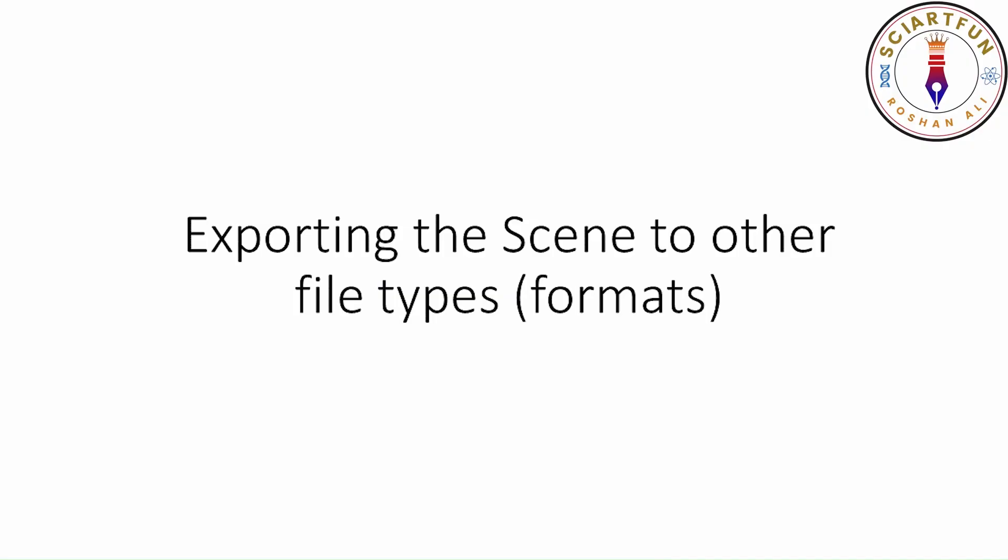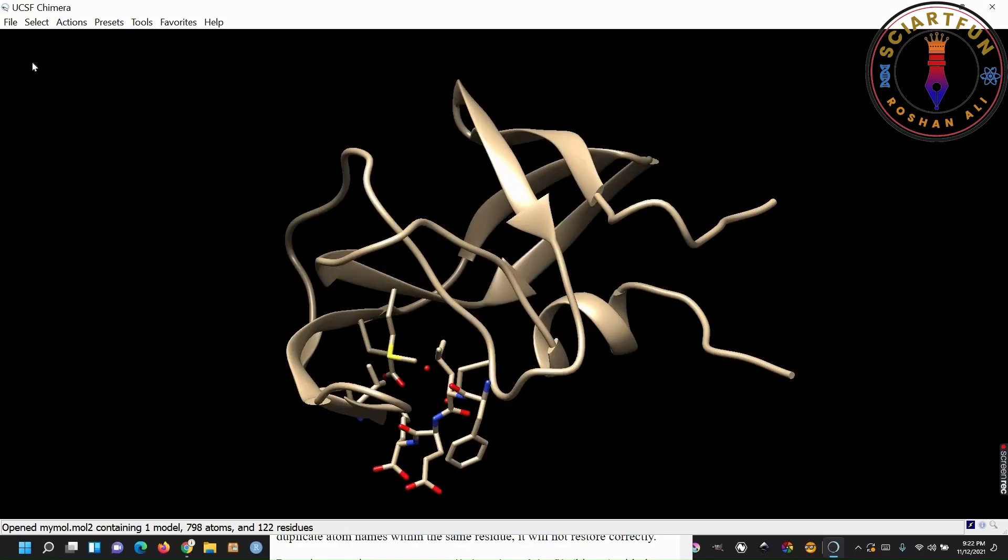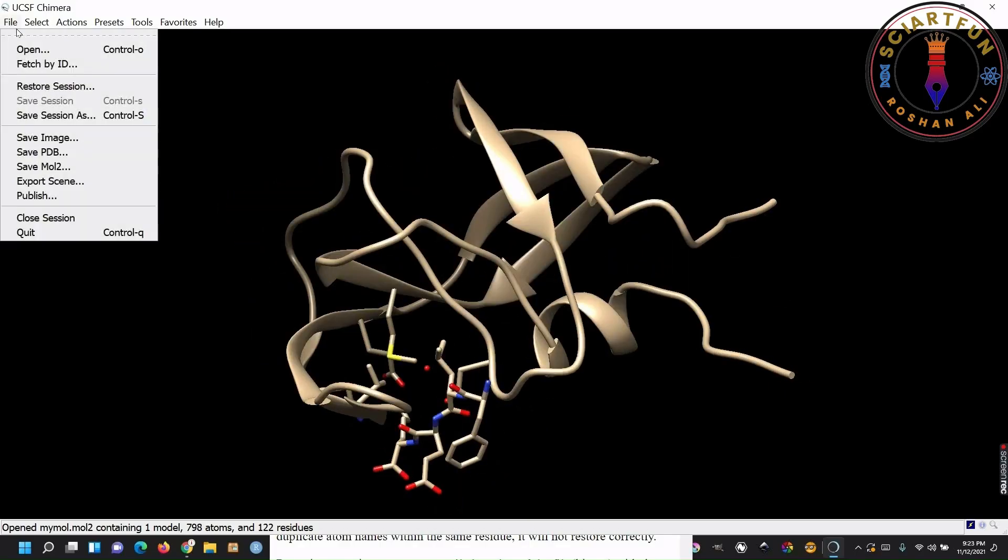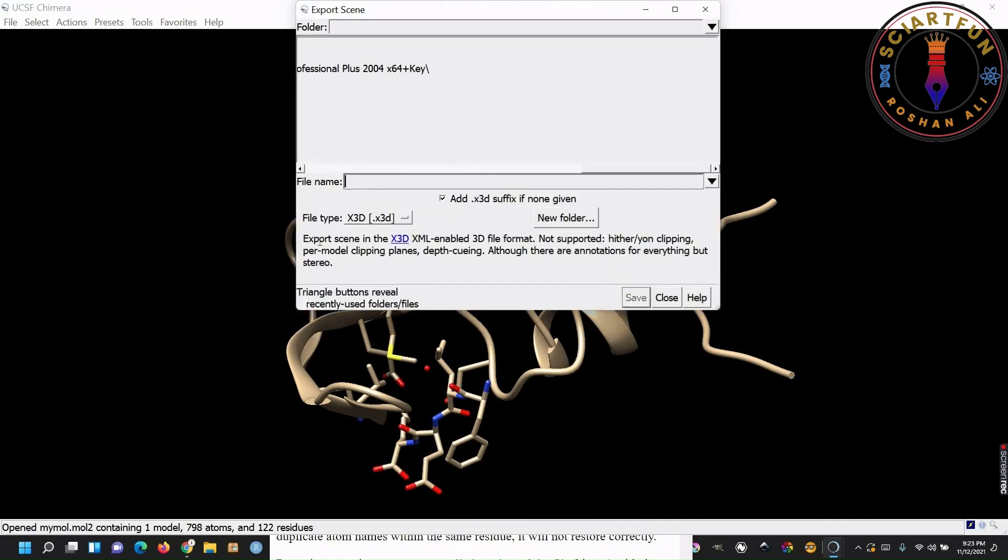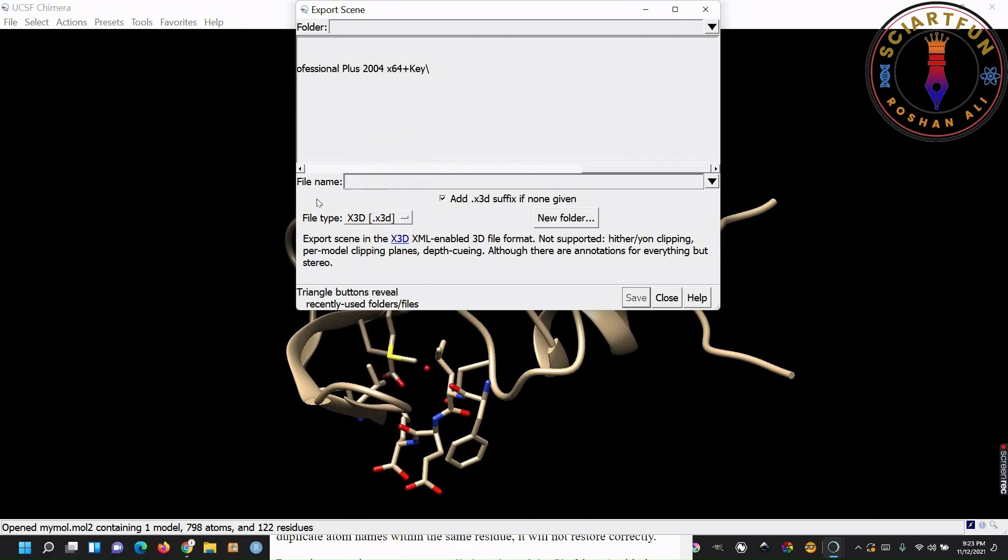You can also save your structure into formats, other than PDB and MOL2. For that you have to click export in the file menu. Select the file type from here. Type the name of the file and click save.